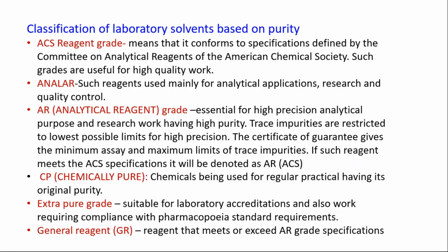Please read this up, and you need to understand the classification of the laboratory solvents that are used. We have different grades of solvent.